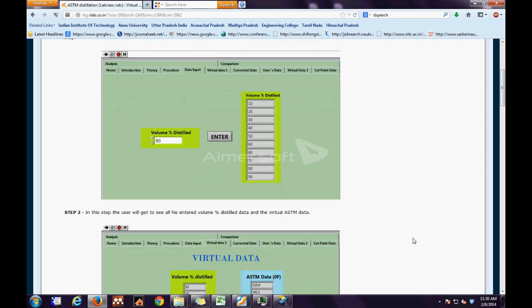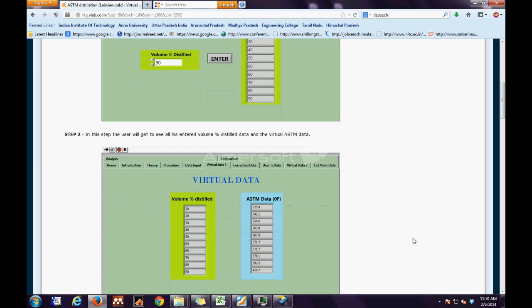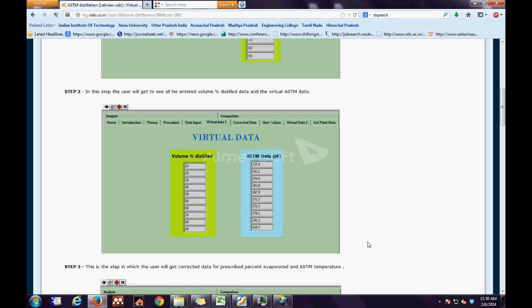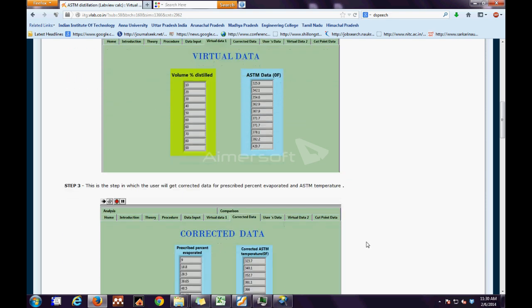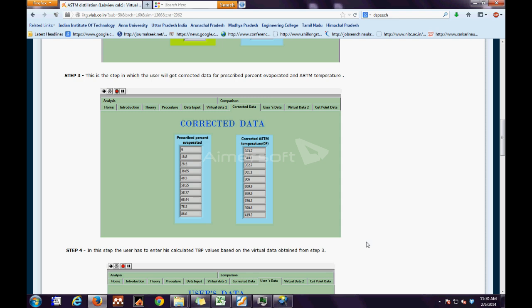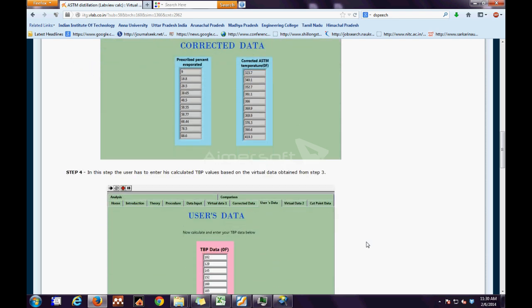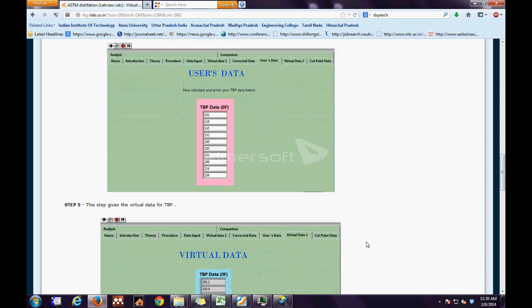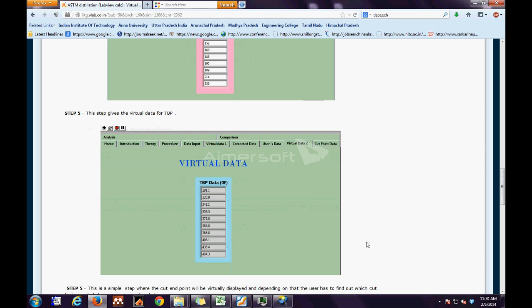The first step is to get the virtual data for volume distilled. In the next step, the user will get to see all his entered volume percent distilled and the virtual ASTM data. In the further next step, the user will get corrected data for the prescribed percent evaporated and ASTM temperature. As we go ahead, the calculated TBP is based on the virtual data obtained from step 3.